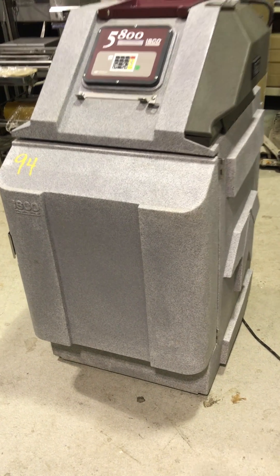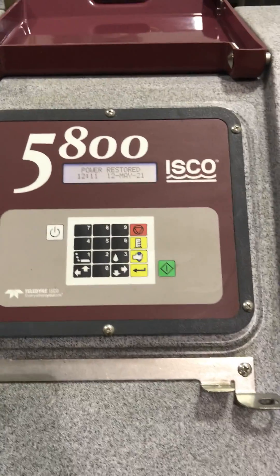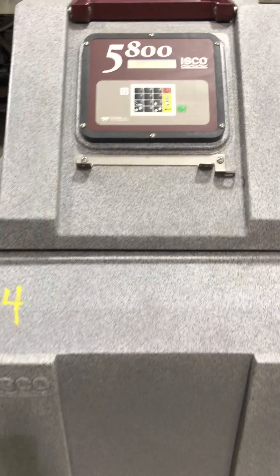This is a quick video to show the features of this ISCO refrigerated sampler, model 5800. And as you can see, this is in really good condition. Top to bottom, it's super clean.